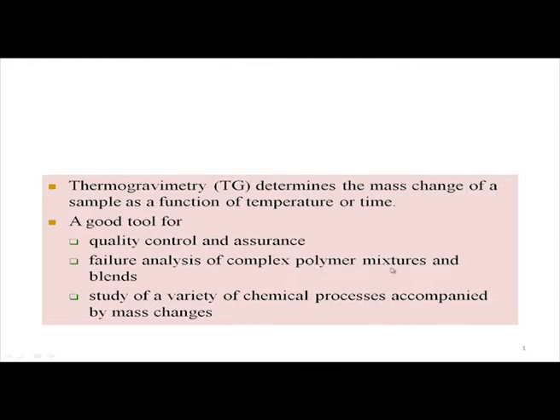So, if we have polymer mixtures and blends, their thermal stability is also very important, because at that particular temperature, whether we are using below 50 degree centigrade or we are using that particular sample for the car component, because the car engines and body and all these things have some variable power consumption as well as the temperature rise for all these components. So, this is about polymer mixtures and their blends and how good they are.